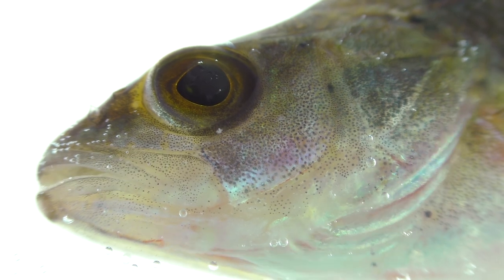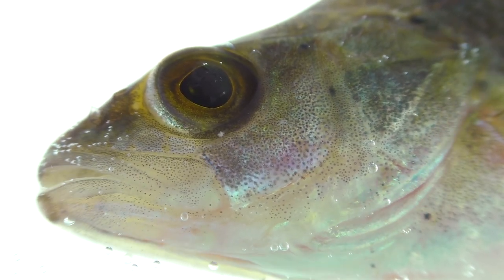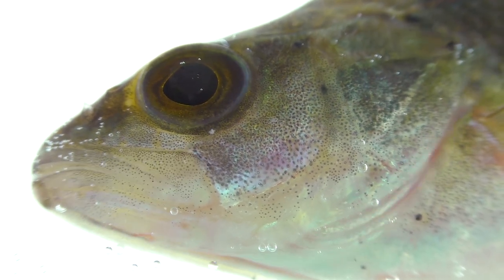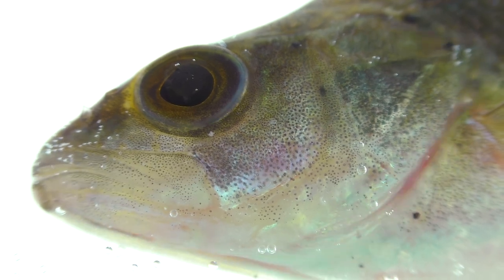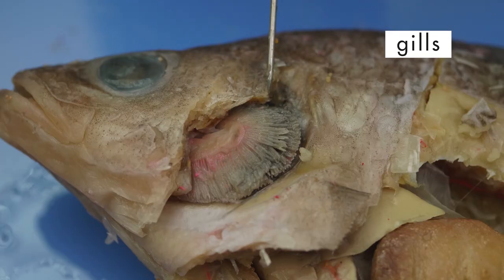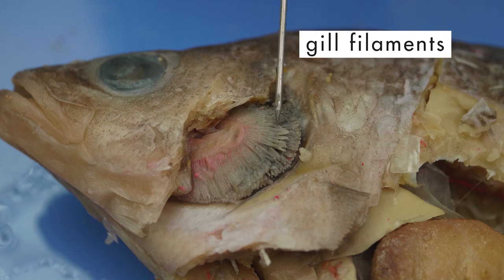A bony fish takes in water through its mouth and uses its muscles to force the water through the gills to extract oxygen from the water. Then, the operculum opens to allow the water to exit the fish. A perch has four gills on each of its lateral sides. The gills are arranged in flat layers. Each gill is made of tiny gill filaments.